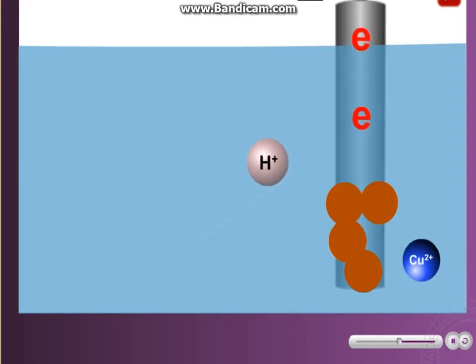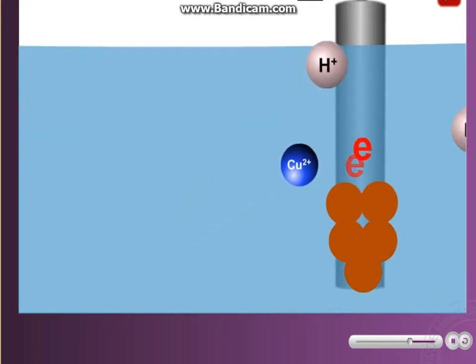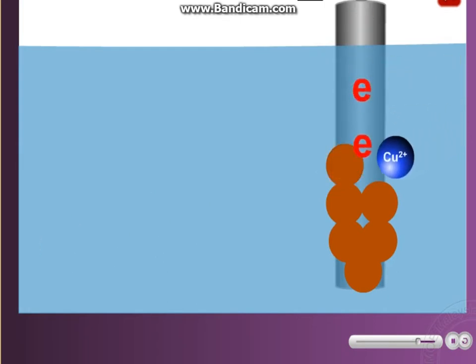In this case, the copper-2 ions are selectively discharged. Each copper-2 ion accepts two electrons to form a copper atom. Reddish-brown solid is formed at the cathode.